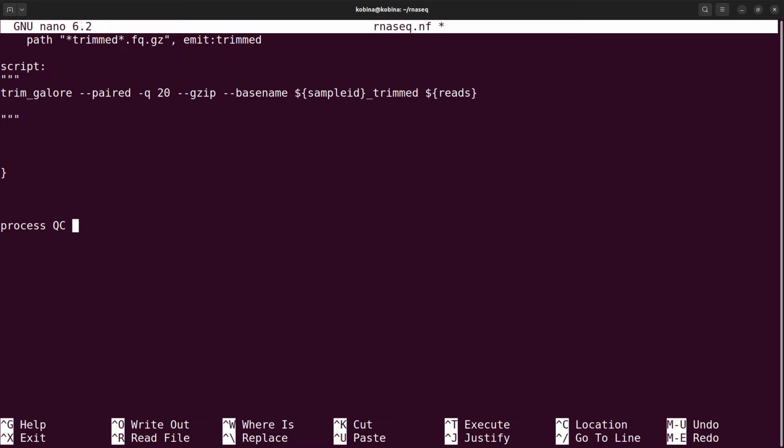So I'll just say QC and that should be fine. All right. So I'll just say QC and then I'll just do this. Again, here I'll also use publishDir. So I'll say publishDir and I'll say QC reports. All right, comma mode will be copy.